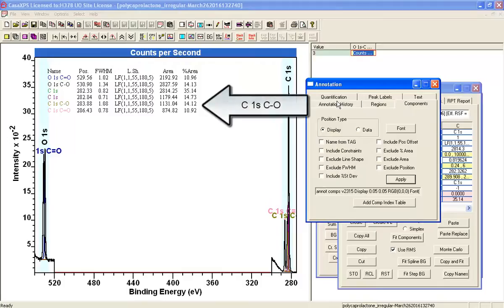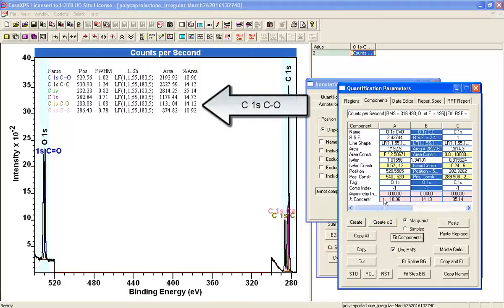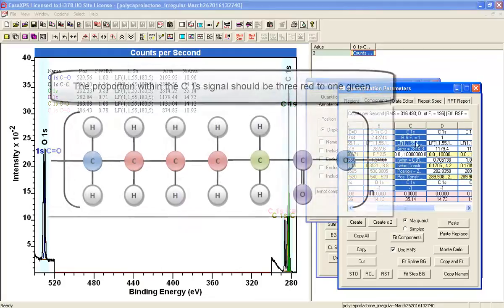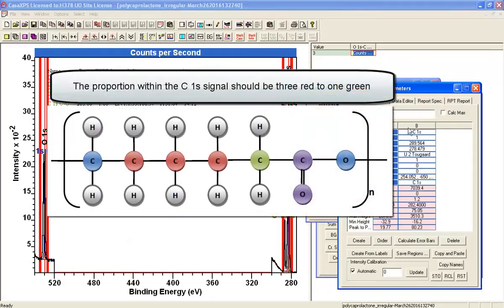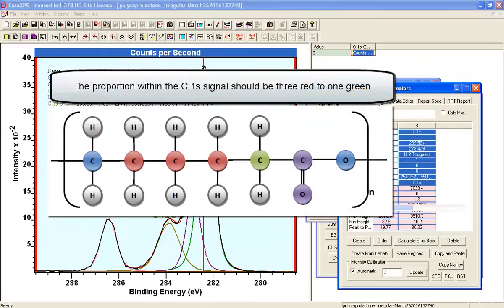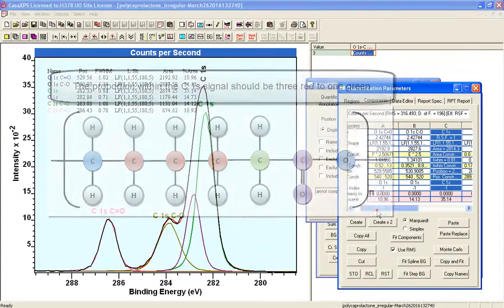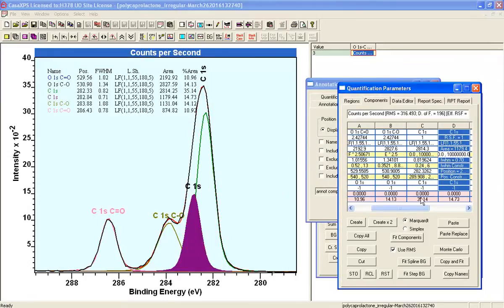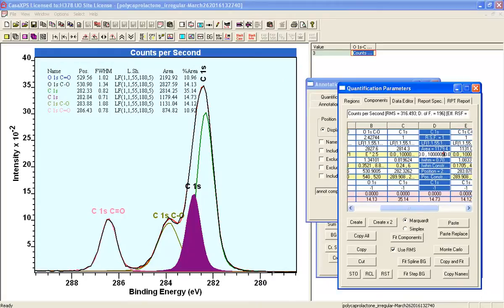The only thing that might be slightly odd is the relationship that I have. I need to first of all zoom into the carbon so I can see which one of these is the CH and that's the CC type. The relationship is perhaps not quite as I'd expect for this material.